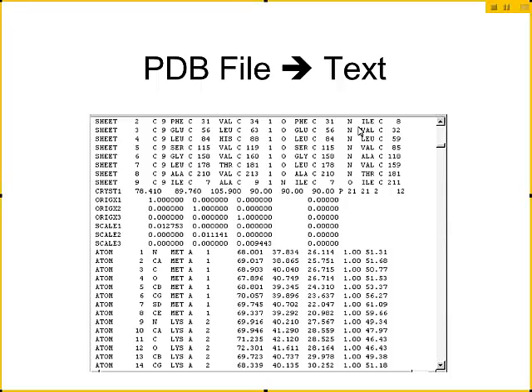That's why we're next talking about what the PDB file is like. It's actually a text file. So you can look at it if you're on Windows. You can look at it using WordPad or Notepad.